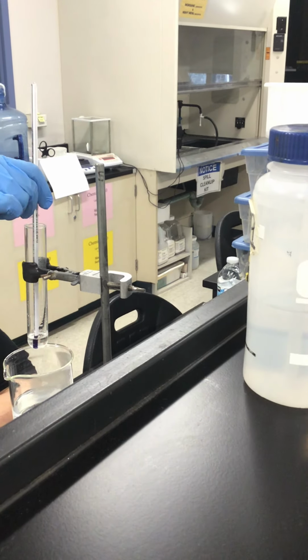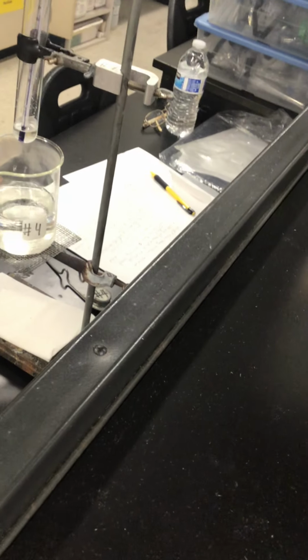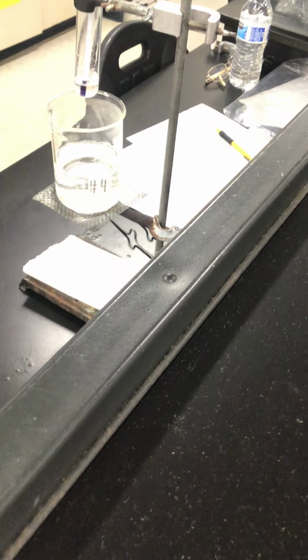42. 42. Another 42? Yes. Didn't change that much.